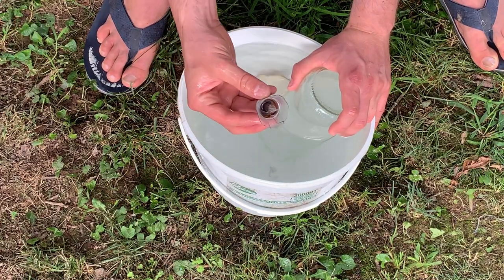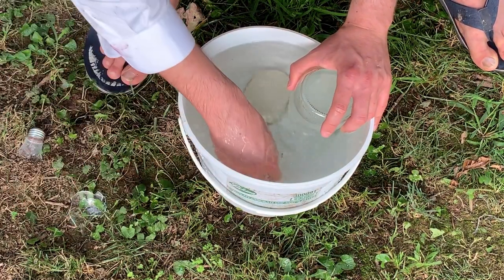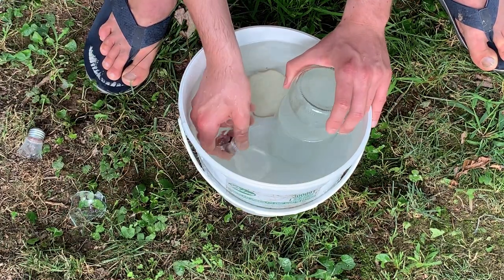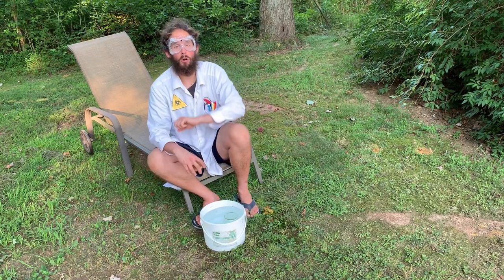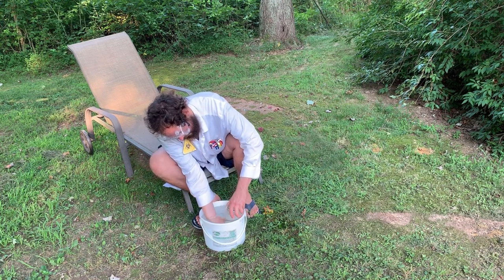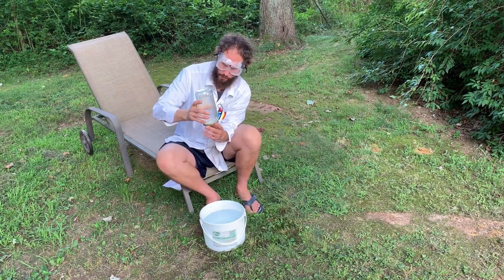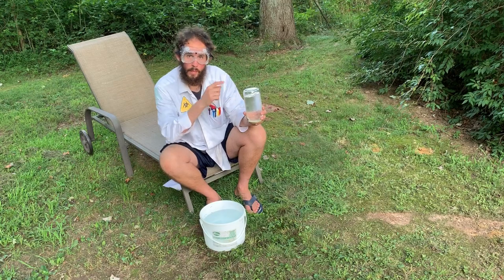The bulb has broke, and the argon gas is now inside of the glass jar. This is very dangerous because I'm working with little shards of glass. Now for the second bulb. After crushing the incandescent light bulbs and collecting the argon gas, I'm going to take the lid, submerge it into the water, and seal the glass jar as tightly as I possibly can. Make sure it's not leaking. I have successfully collected elemental argon. Let's head to the laboratory.